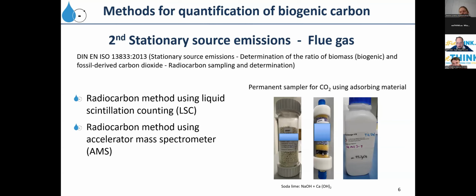It is either adsorbed on solid chemicals like soda lime, or it is absorbed in fluid soda. Both can be used and analyzed.